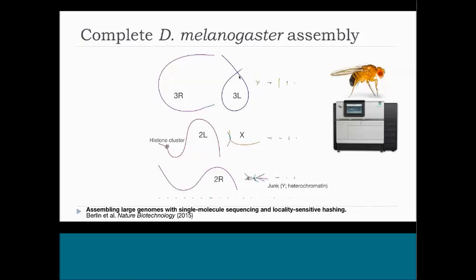And so this was really astonishing to me at the time to see the power of these long reads, because it was the first time we were really able to reconstruct a complex genome like this from telomere to centromere without gaps.